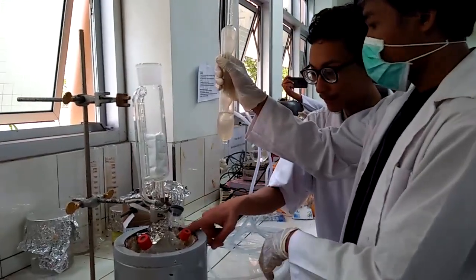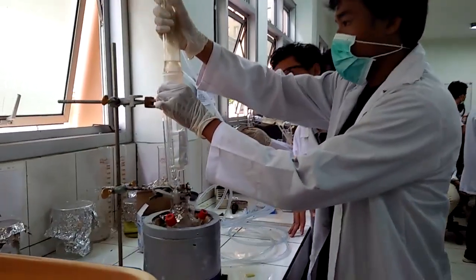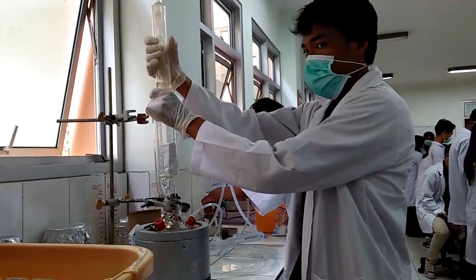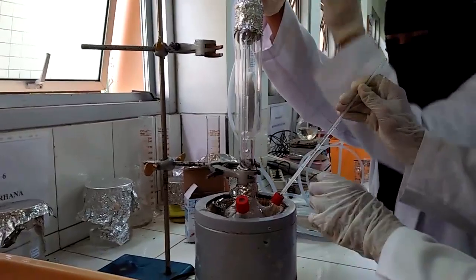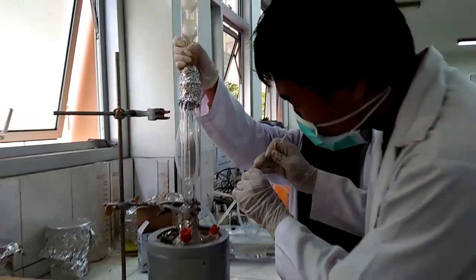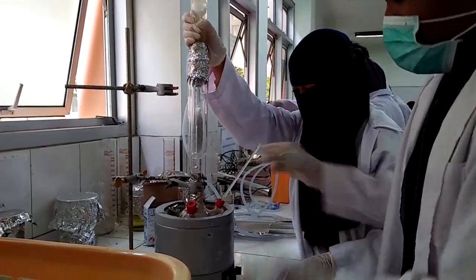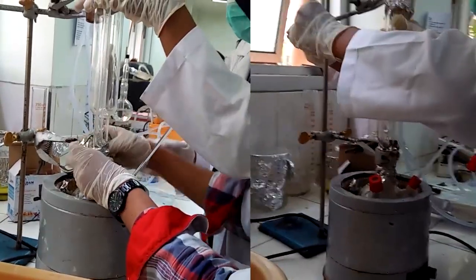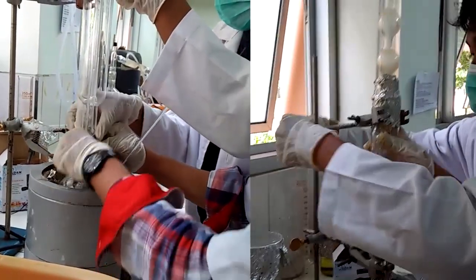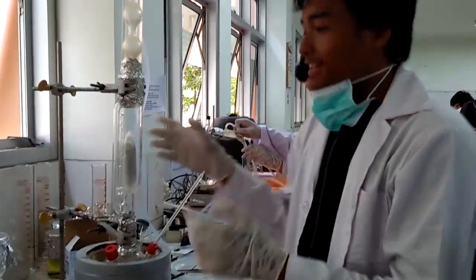Kemudian dimasukkan pelarut etanol ke dalam labu dan juga sampel yang telah dibungkus dengan kertas saring ke dalam tabung soklet. Setelah itu dihubungkan kembali kondensor yang sebelumnya dilepas untuk memasukkan sampel. Setelah itu dimasukkan termometer pada labu untuk mengukur suhu dari pelarut.